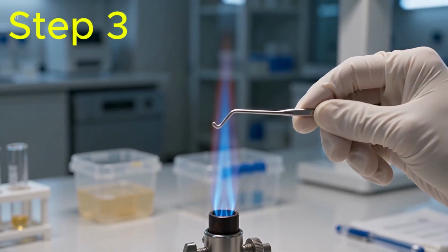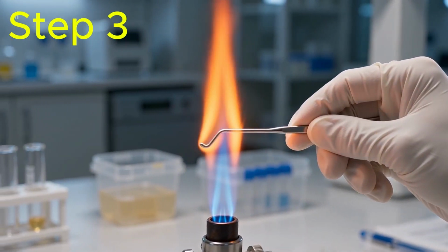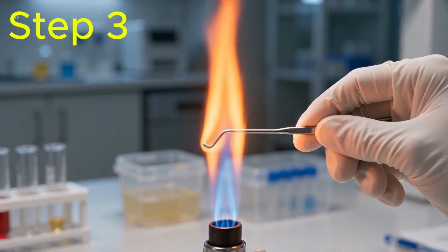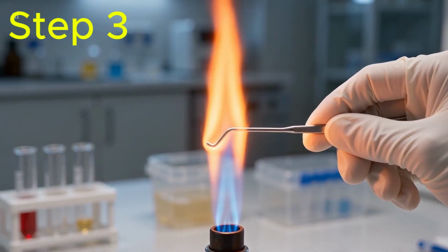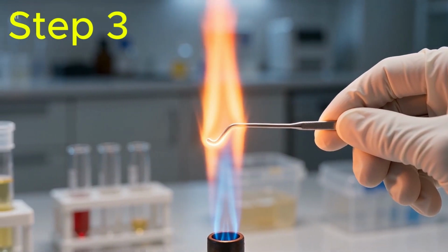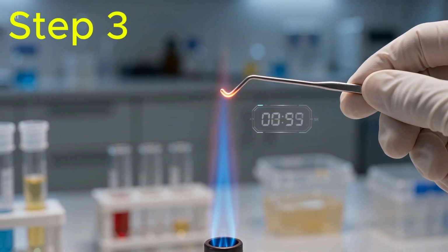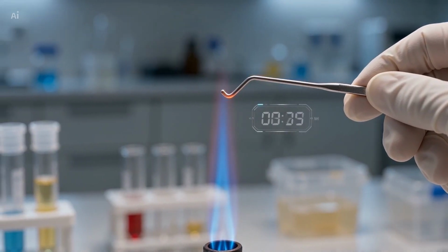Step 3. Sterilize the loop or needle. Now sterilize the inoculating loop or needle by heating it in the hottest part of the Bunsen burner flame until it becomes red hot. This destroys any microorganisms present on the instrument. Allow it to cool for about 10 to 20 seconds before touching the culture.